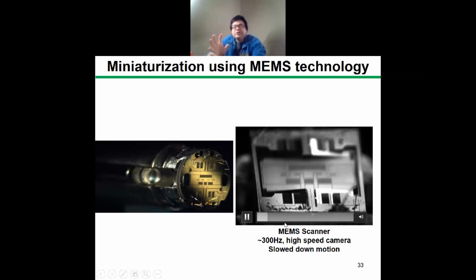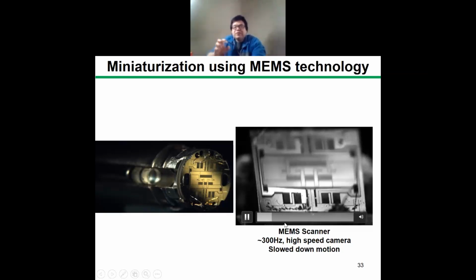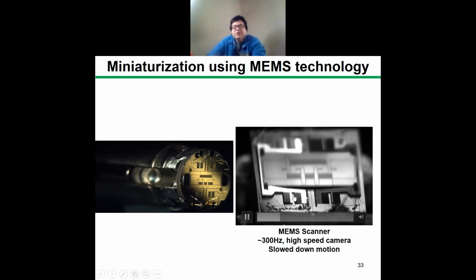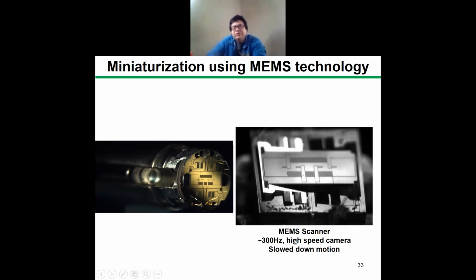Essentially the scanner can switch the cross-sectional imaging modality from horizontal to vertical smoothly. This one has a large travel in the Z direction, which is very unique in the field.